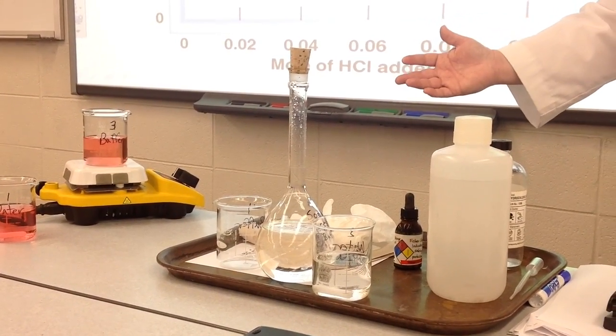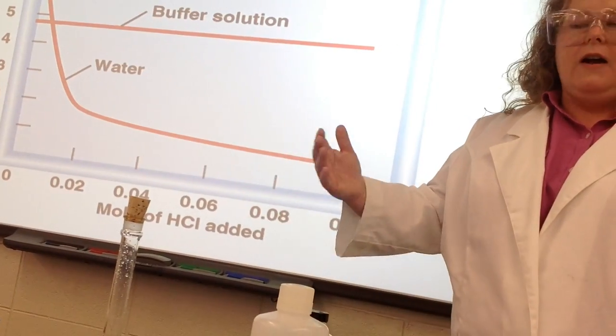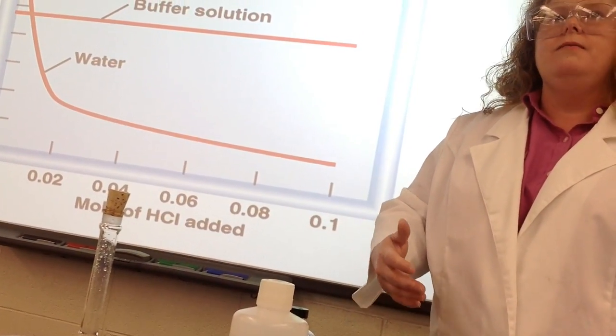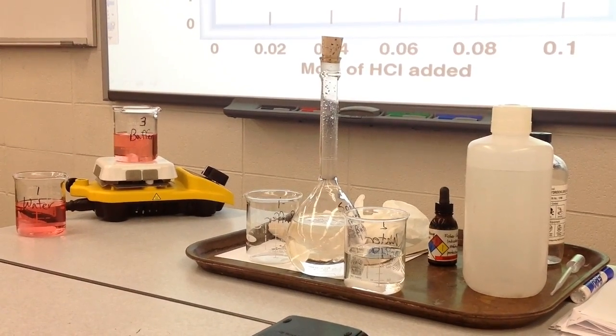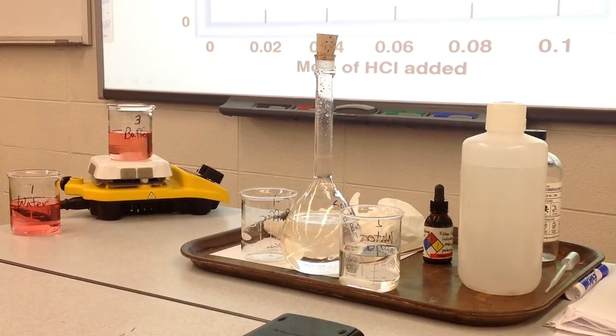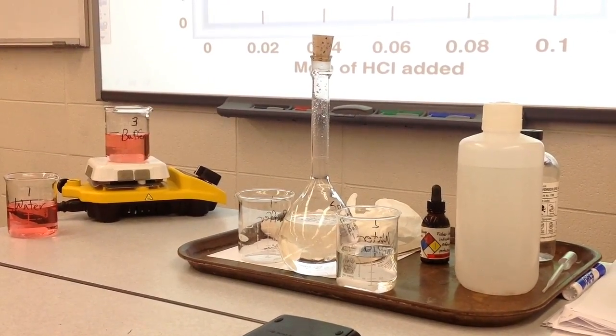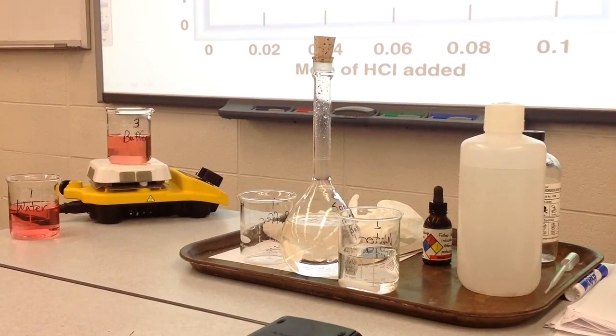Okay, but right now it's kind of a light pink. Now if I add the acid and we see a change in pH, you know if it gets more acidic it should get darker. Okay, but if it doesn't change then we can assume that there wasn't any change in pH.